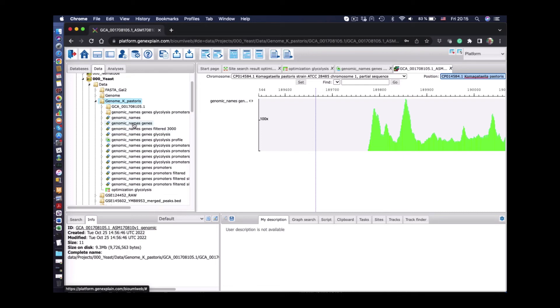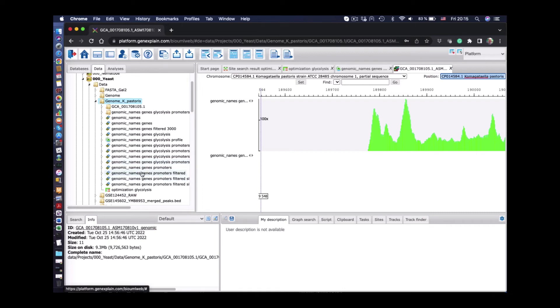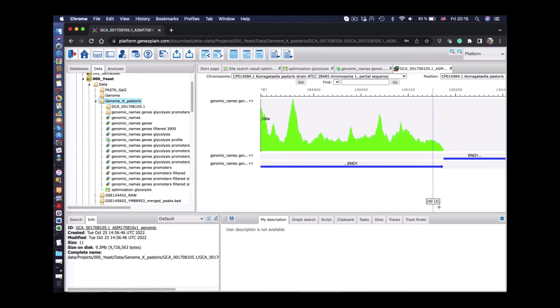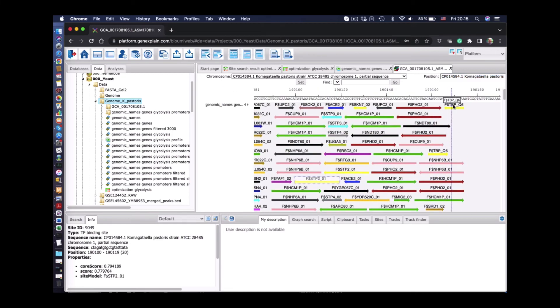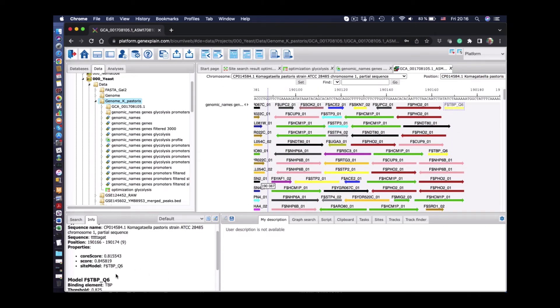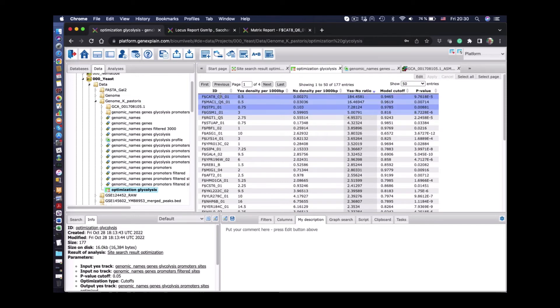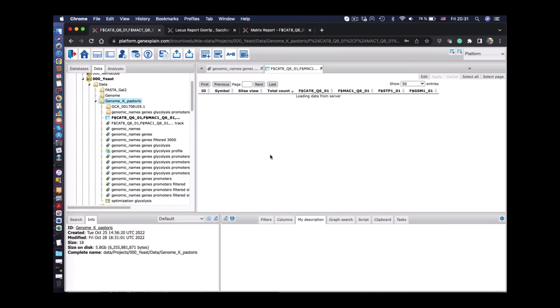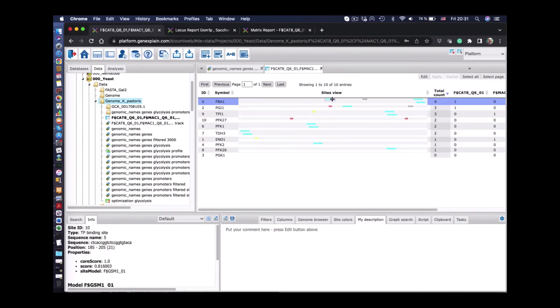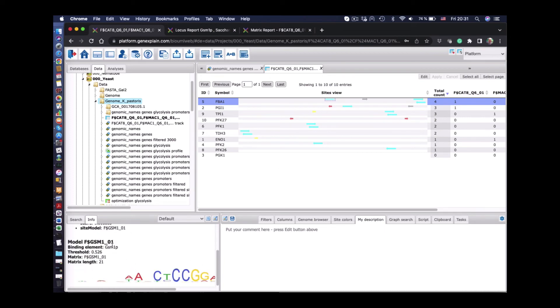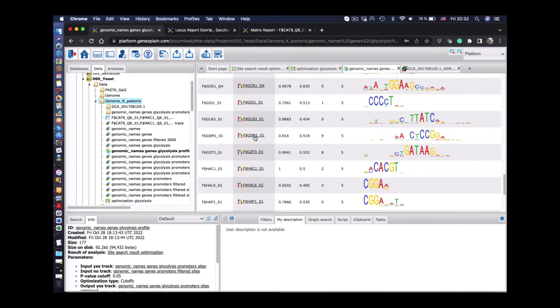We can add the annotation of the promoters and annotation of all genes to see that indeed those sites are found in the promoters of those genes. For instance, one site corresponds to the factor TBP, which is known to be located near the start of transcription. We can also visualize sites for the top enriched position weight matrices — for instance, in this table we see those sites for the top enriched matrix for the factor called GSM1.